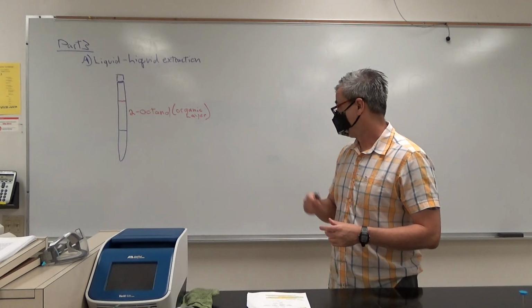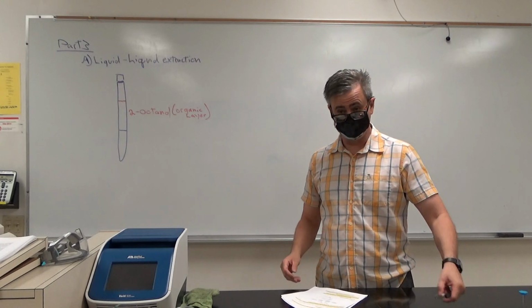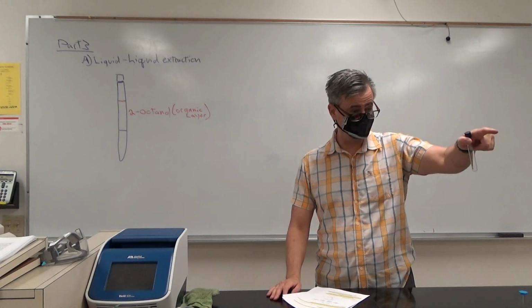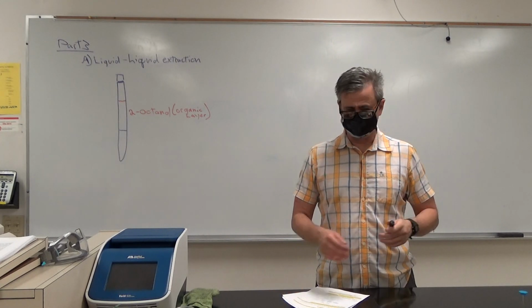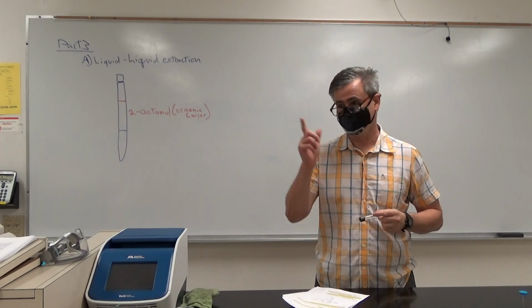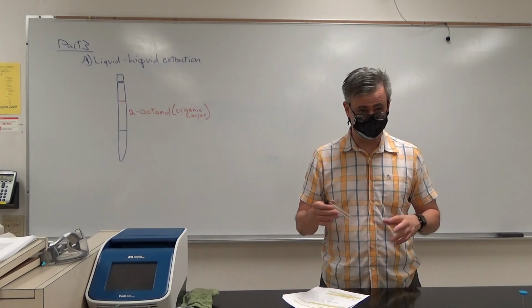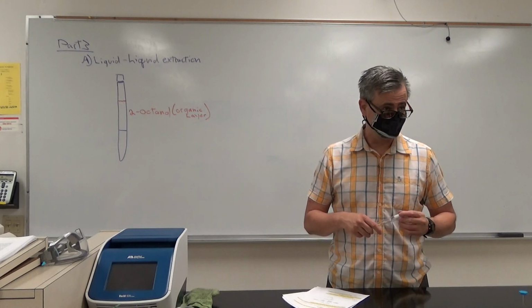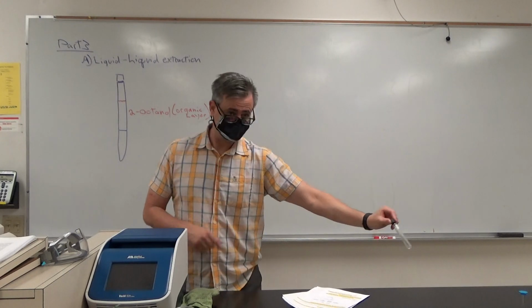And so we'll shake it up, we will then put it in the centrifuges. Okay. What's the most important rule about using a centrifuge? Balance. Yeah, exactly. So the easiest thing is wait for somebody else that's ready to do it, and then put it in the centrifuge, socially distanced, like this.